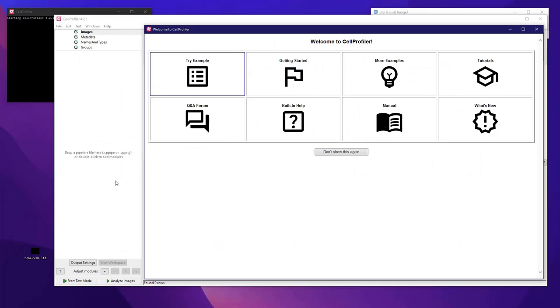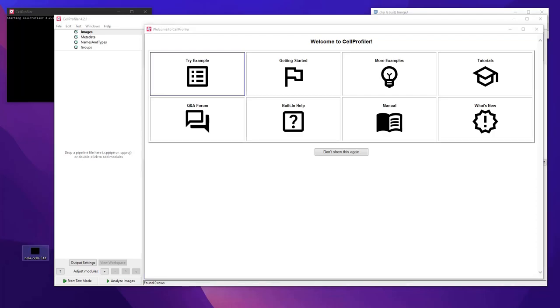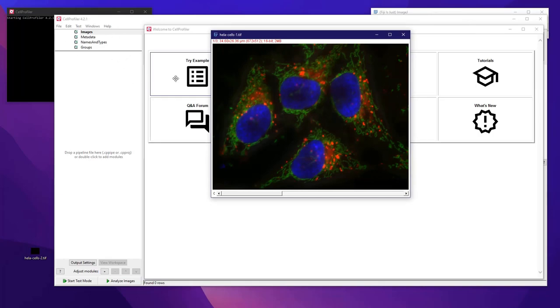Hello! In this tutorial I will show you how to use CellProfiler. I will show you the basics of how it works and how to create a pipeline. For this I will use an image that you can find if you are familiar with ImageJ — this set of HeLa cells. I've just converted it for the sake of this demonstration, but it's basically the sample image that you can get from Fiji.